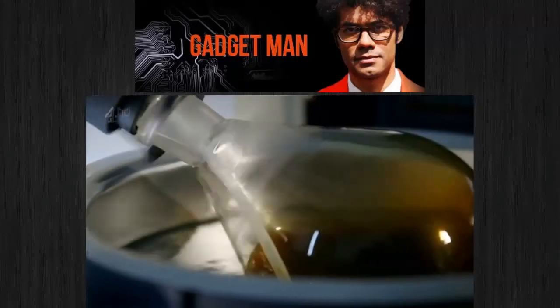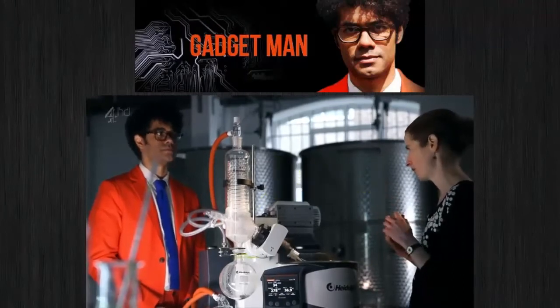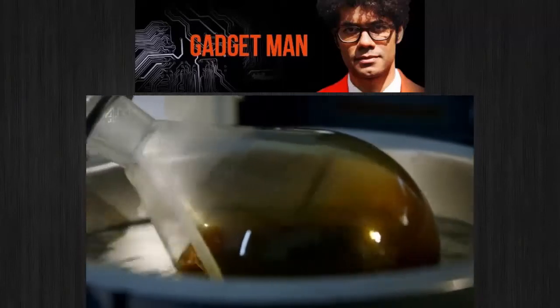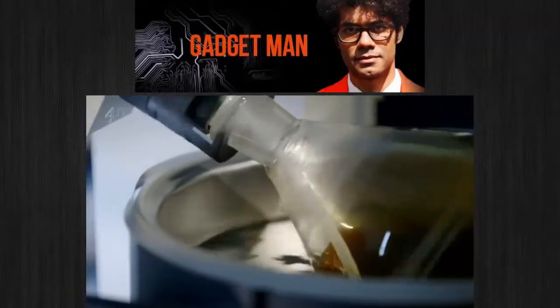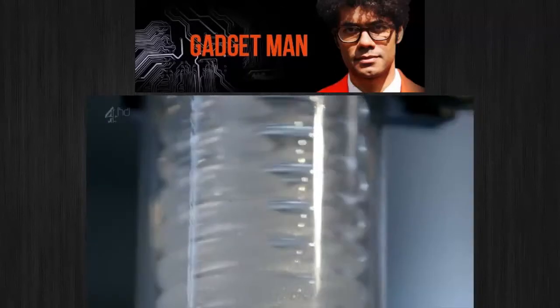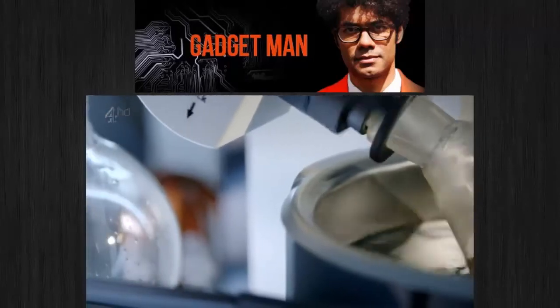What we've got here is the rotary evaporator, which separates liquids according to their boiling point. In the flask, espresso coffee is heated to a temperature where the volatile particles that give it flavour and smell evaporate. In the curly tube, they are condensed again, now liberated from the earthly form that has held them back for so long.